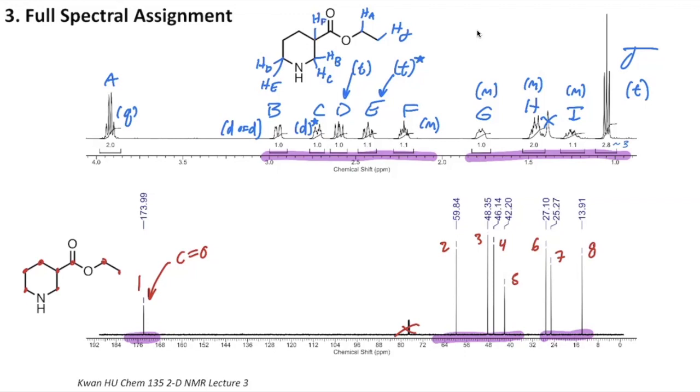Just doing a quick sanity check about the chemical shift of proton F. In our second example, we also had an ester compound, and we talked about the appearance of those alpha protons next to a carbonyl at just about 2 ppm. That makes really good sense for the signal at F because it's just above 2 ppm. That checks out for the shift of an alpha carbon's hydrogen. Okay, I think we've got some good starter assignments there.